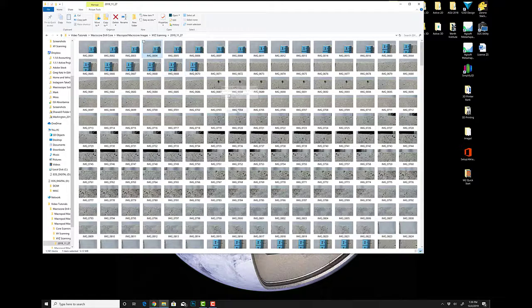Just use our intuition for a second and realize that in the next batch of images, when the camera moved down core, we actually still have the entire corner of the sample. So this is sort of overlapping information. We actually don't need any of these images.